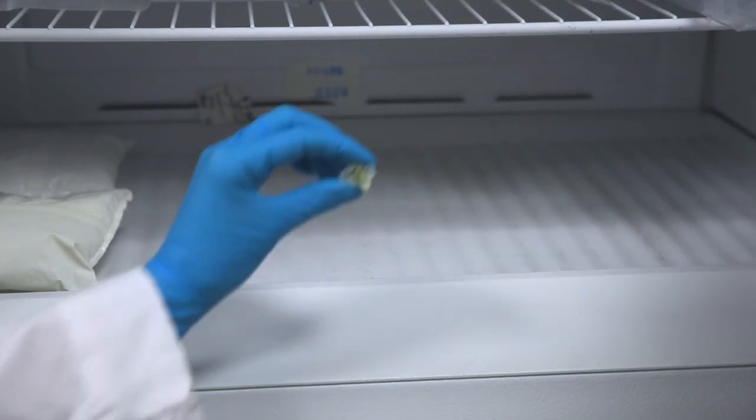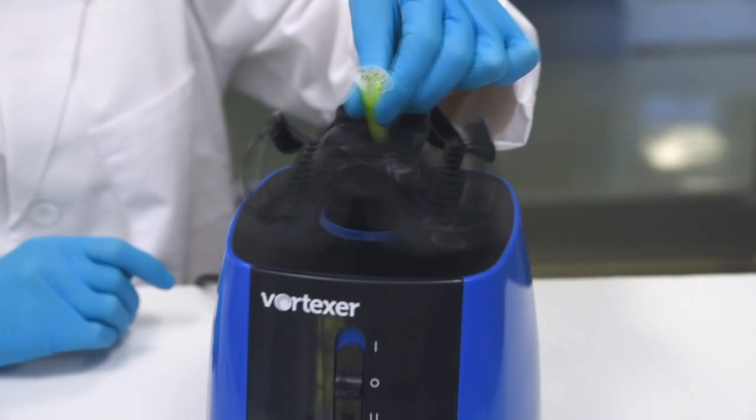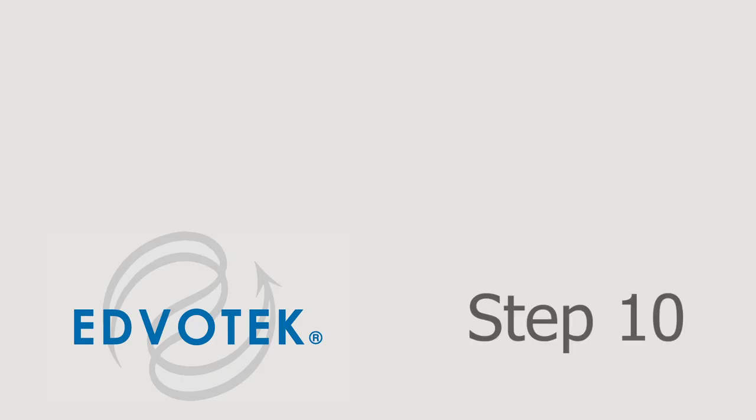Step 9: Repeat steps 6 through 8 two more times. Freezing and thawing will help the cells to lyse.